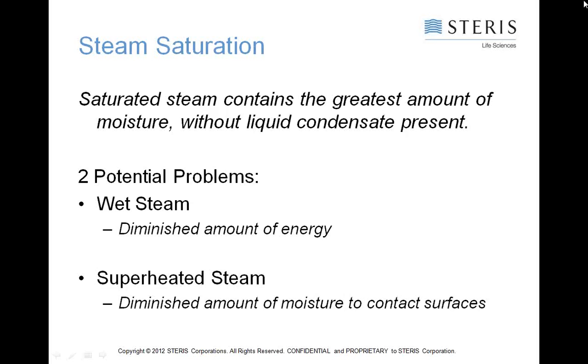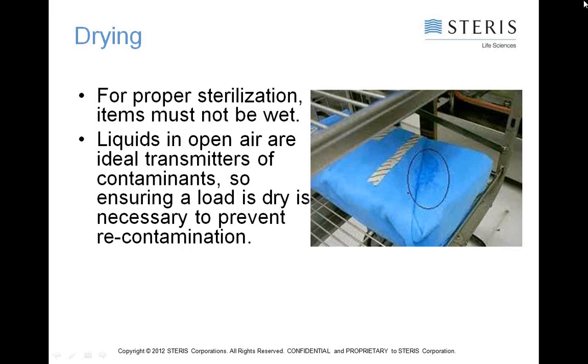basically dry itself. Now, if you have items that have low specific heat, like rubber stoppers or plastic, that's where, of course, you're going to run into challenges with drying. Glassware, stainless steel, items like that, they have higher specific heat and are much more effective in essence at drying themselves. So those are, up to this point, the 6 basic principles.